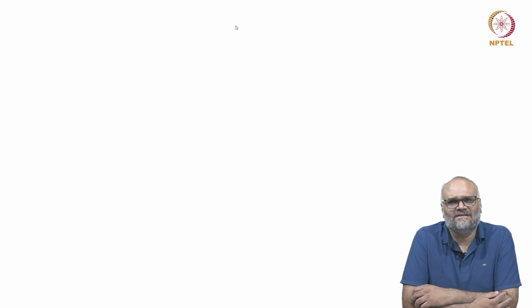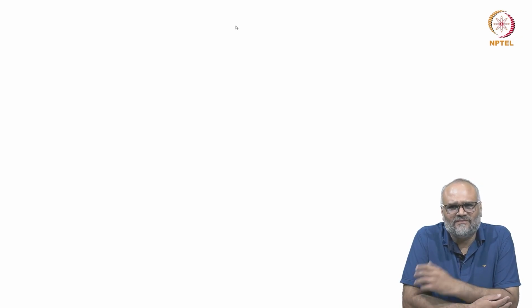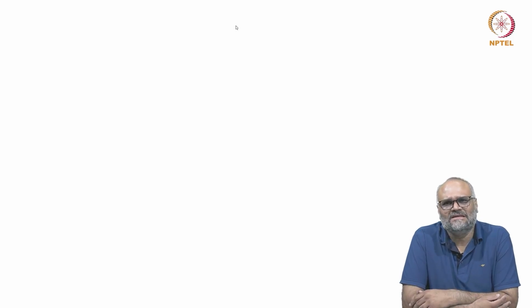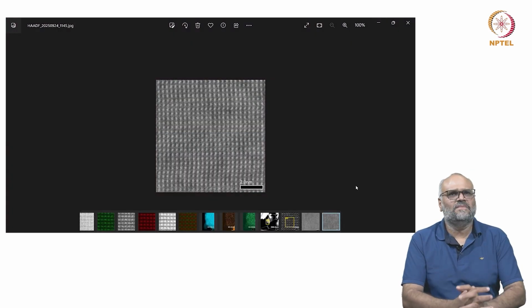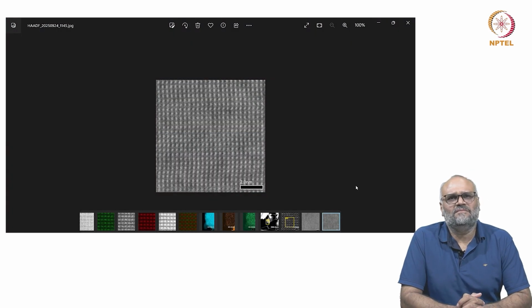Now, when you look at the data that is recorded in the microscope, you typically get images of either a TIFF or any other format such as DM3, depending on how you're recording, using which camera or which software. So if I have a look at how the raw data recorded in STEM mode looks like, here is an example of a STEM micrograph from strontium titanium oxide.